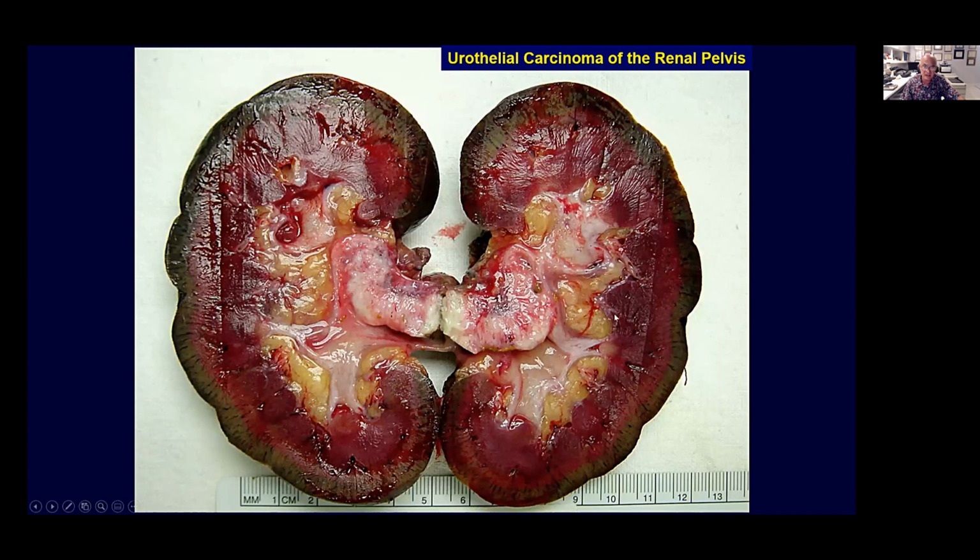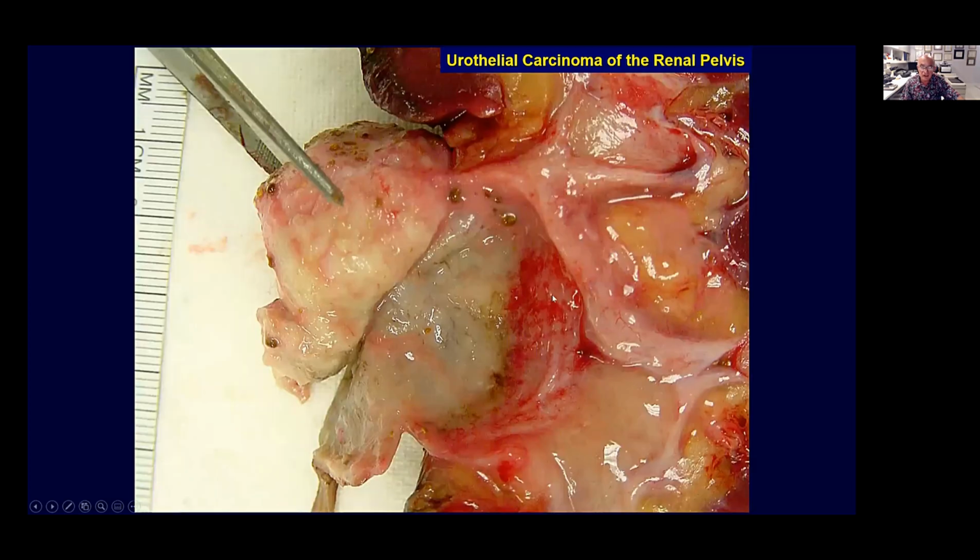Here are some examples. These tumors are very nicely located in the pelvis, kind of forming this molding, and the tumor has been lifted up, showing the area of insertion and also the areas of growth within the pelvis, and the corresponding sections need to be done in the proper way as well.